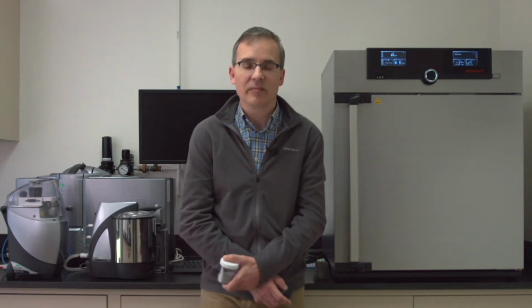Then talking about the type of testing we do in this laboratory, it kind of occurs at three different scales. There's the bulk properties of the powder themselves, such as the powder flow behavior, and that can, again, be comprised of different types of tests. We use something called dynamic avalanche rheology, also conventional funnel flow rate measurements and flow indices. We look at density of the powders as a bulk, apparent density, and tap density. And then more recently, we focus a lot on moisture content of these powders, which can be very low and difficult to measure. And for that, we use a technique called Karl-Fischer titration, which is a chemical titration technique to measure moisture in these types of materials.